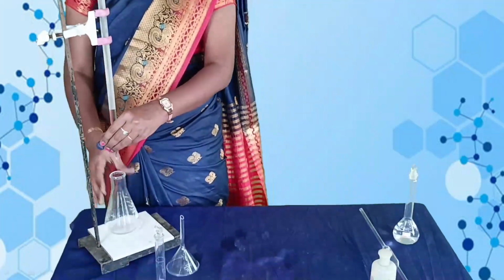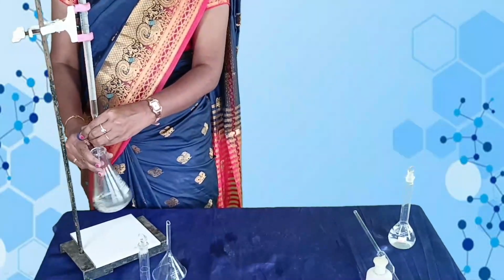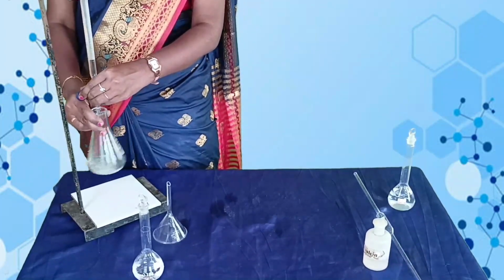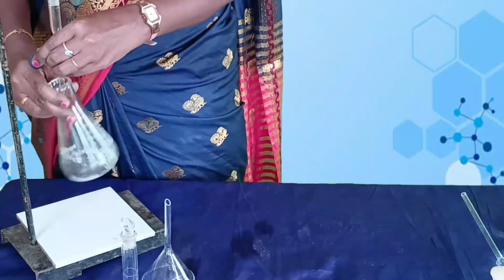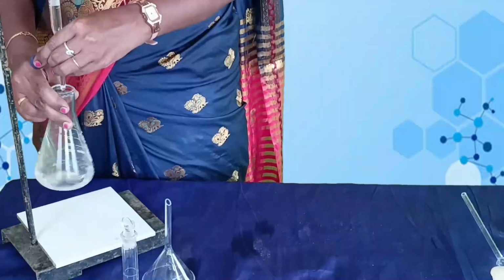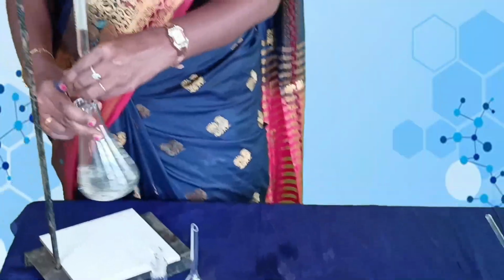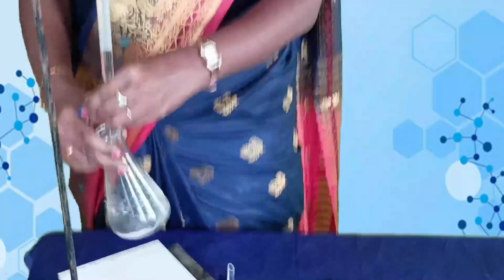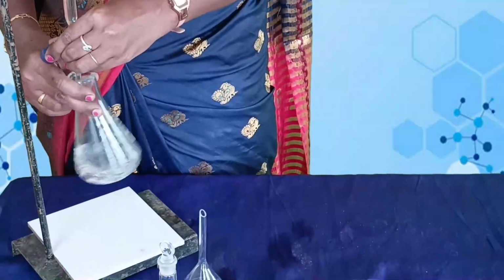Then titrate it against the sodium hydroxide solution which is taken in the burette. Appearance of permanent pale pink color is the end point.